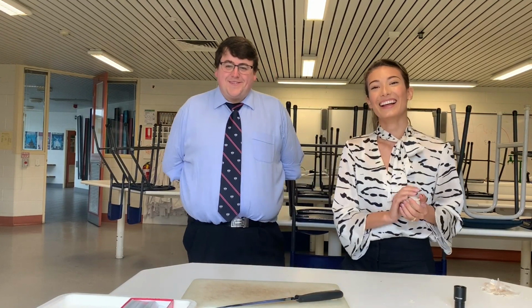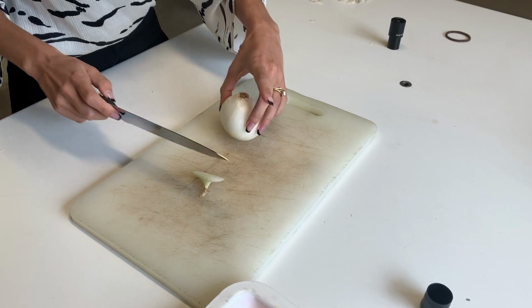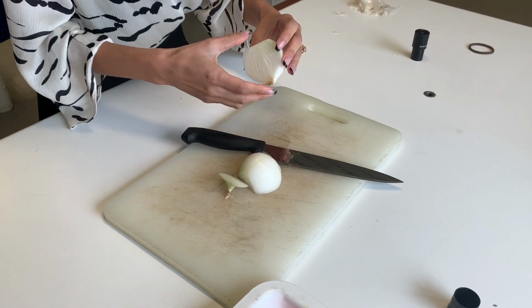Hi 11s and 12s. Today we're going to be doing a demo for you to show you how to prepare an onion slide for viewing under a microscope, and then we're going to show you how to draw out that cell. Okay, so now we're just going to be chopping up our onion to get a nice thin slice so we can view it under a microscope.